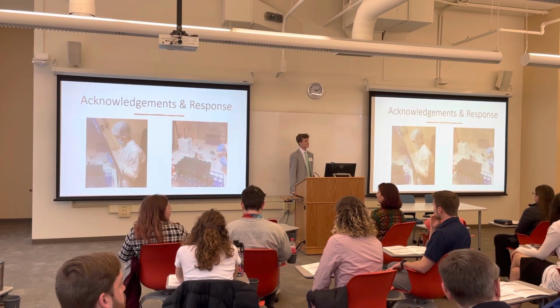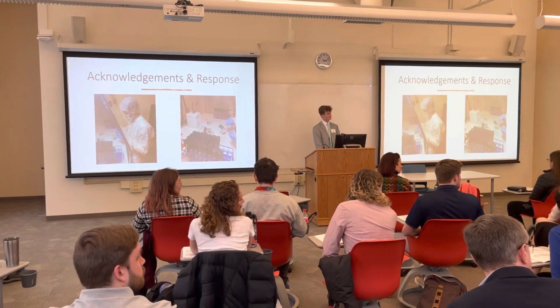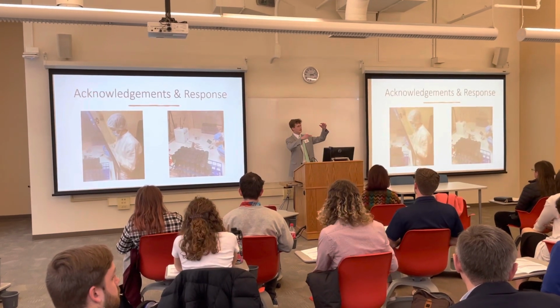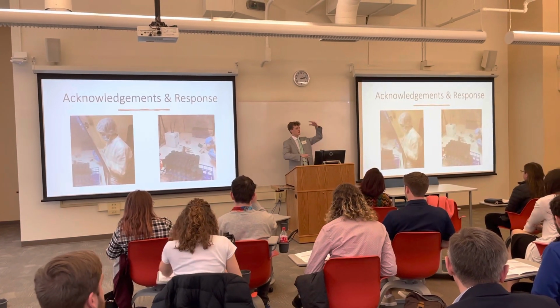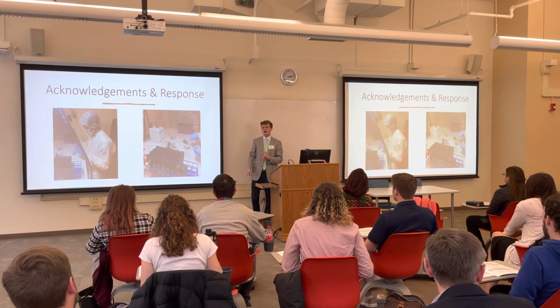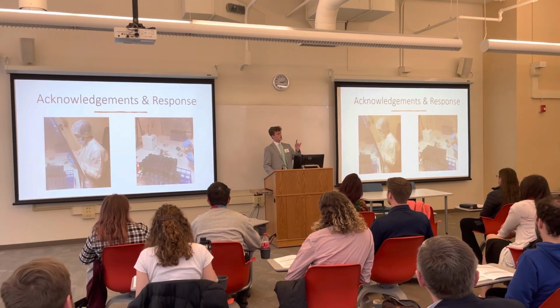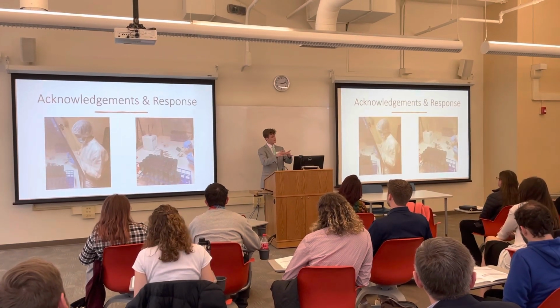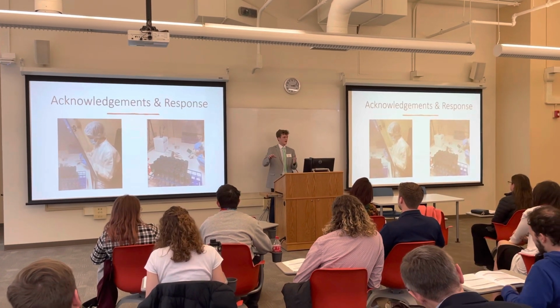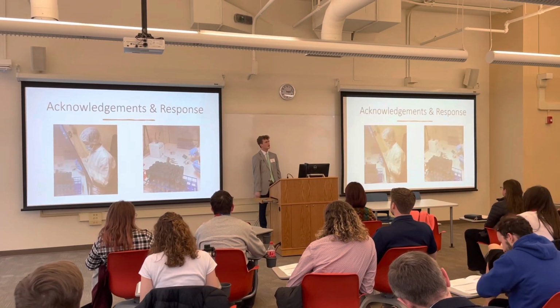Yeah. So when you're inducing a callus, are you using the same parts of the plant for all your samples, or are you going in different parts? So I'm taking a pair of scissors to emerging plants. I'm cutting and snipping, so it's all either stem or leaf tissue, but all of them have stem tissue in them. The other thing that we keep the same is the media. It's Murashige and Skoog media with all the needed nutrients for the plant. So the plant's not missing anything. It's just that added hormone.